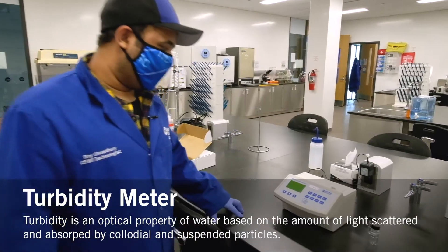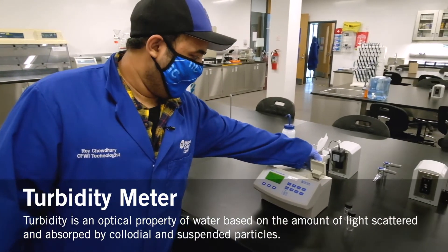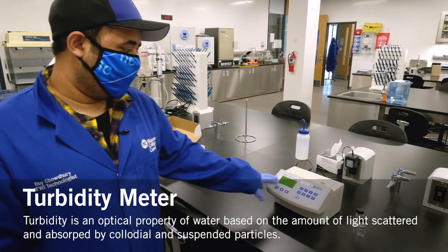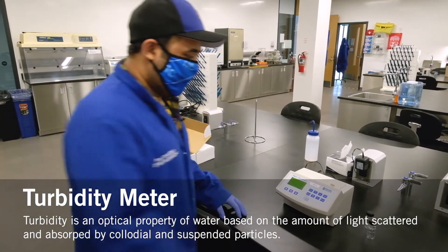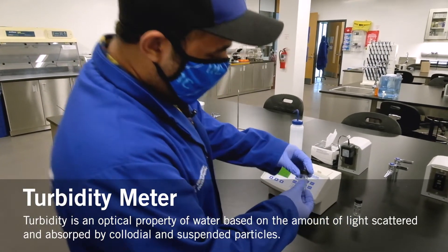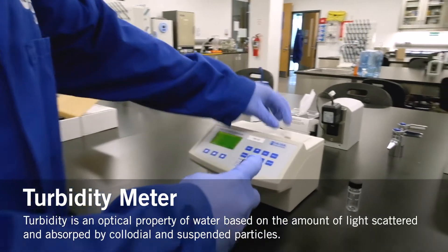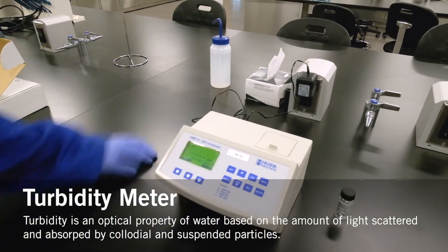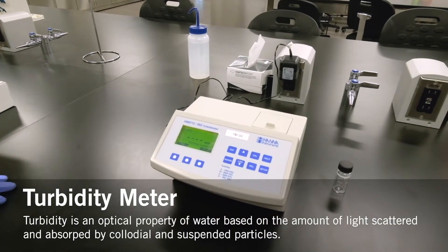This is a turbidity meter. It gives you a reading of how turbid the water is — providing a digital number. You just place the sample you're testing into the compartment and it gives you a reading after about five to ten seconds.